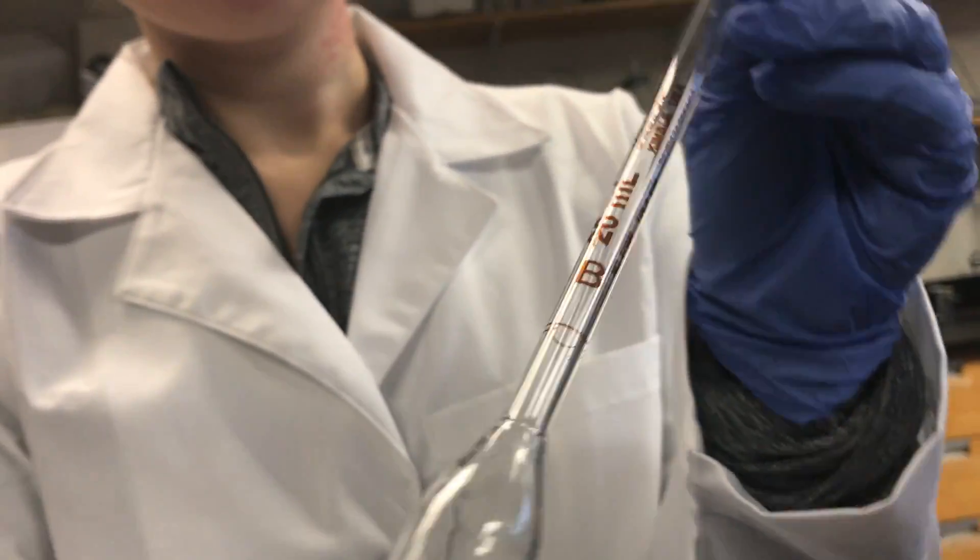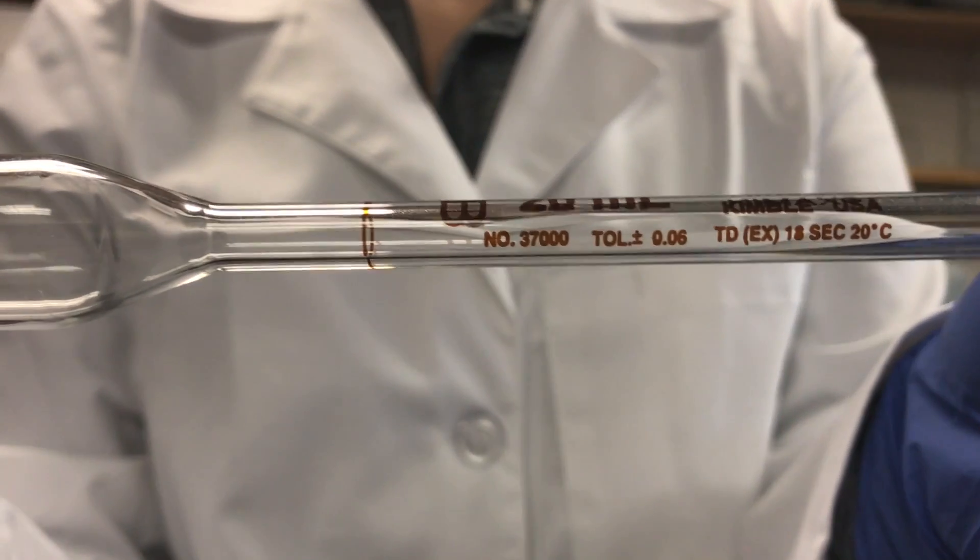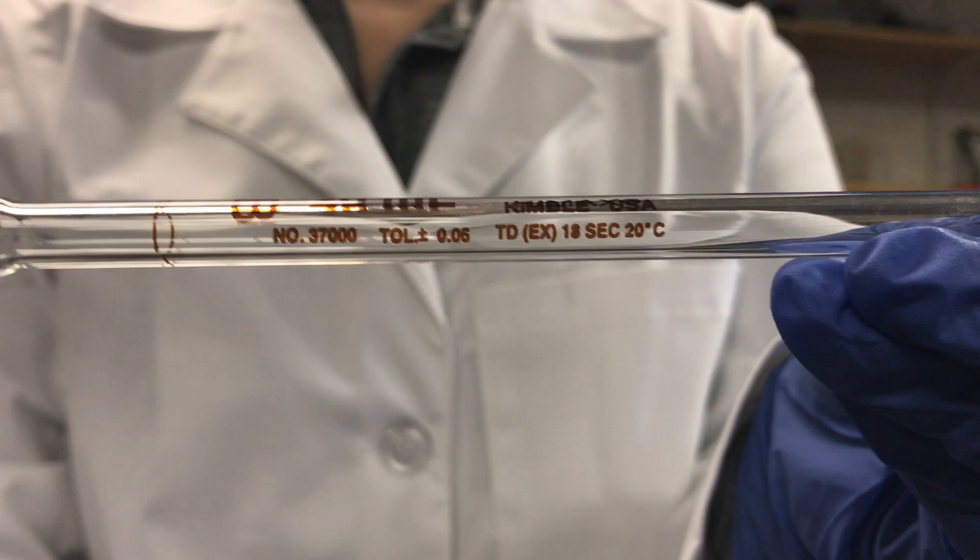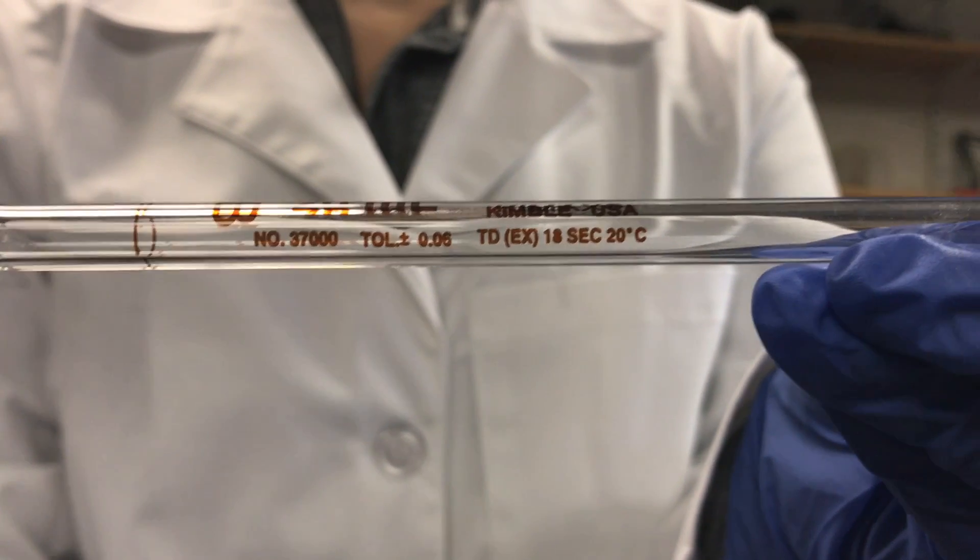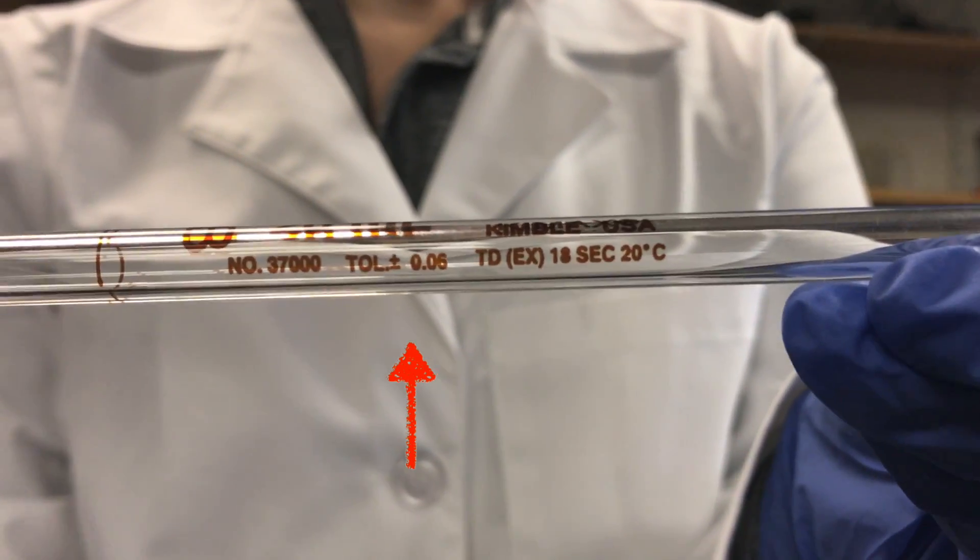Sometimes the error can be located directly on the glassware. For example, this piece of glassware is class B, which has a standard error of 0.06 milliliters.